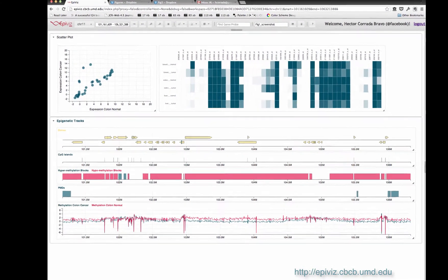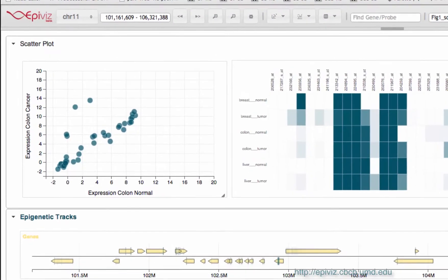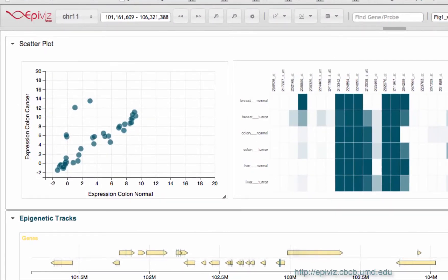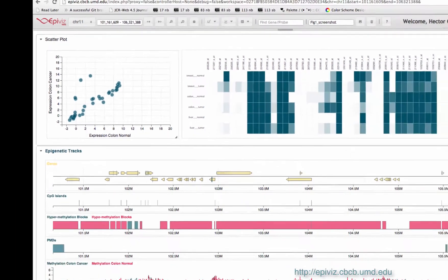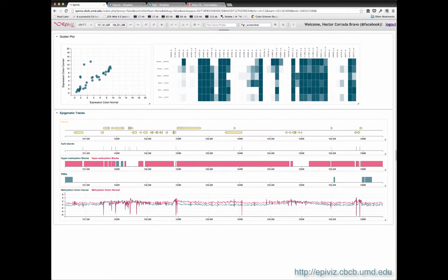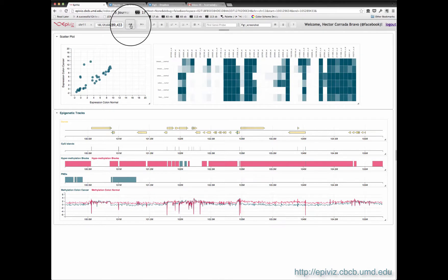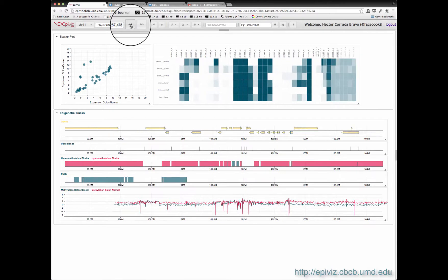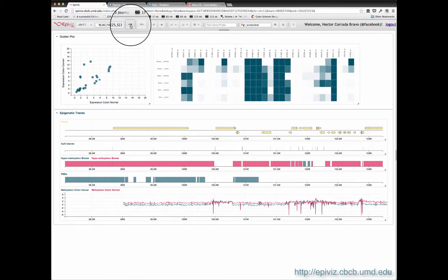There is also data organized by genomic feature, like gene or transcript expression. We use appropriate visualizations like scatter plots to show those. Navigation along the genome works, and all displays are updated, both tracts and plots.